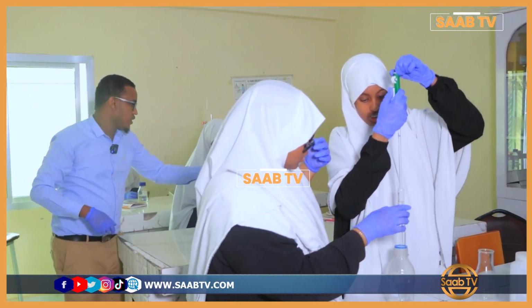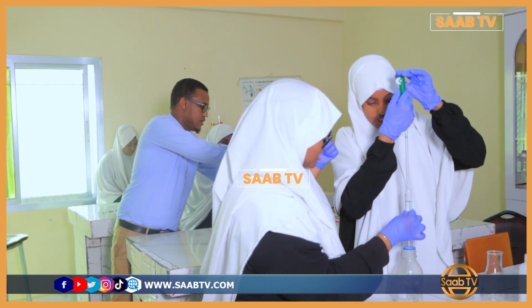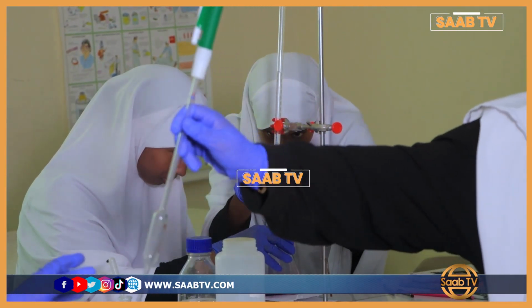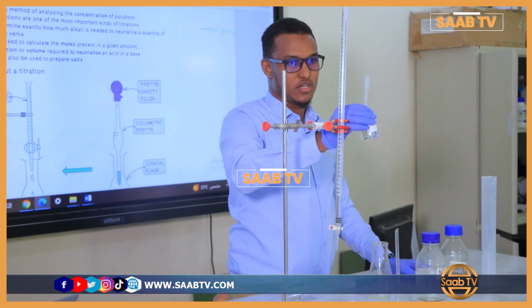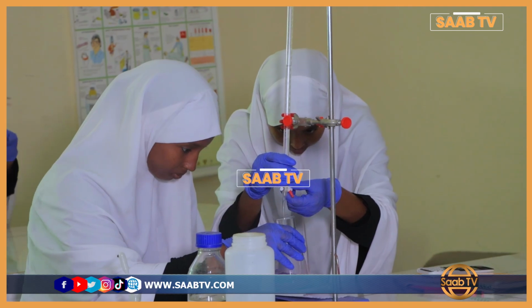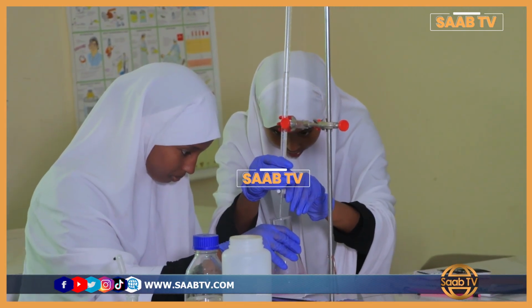So the other chemicals that we need are the base as well as the acid. Which acid? The hydrochloric acid. And the alkaline or the base that we have is sodium hydroxide. Also we have an indicator which is called phenolphthalein. So what am I using this one for? To show us the color change. The color change helps us to determine the end point of the neutralization reaction.